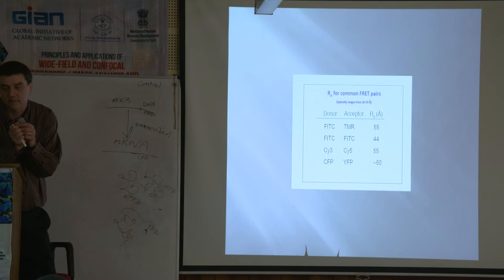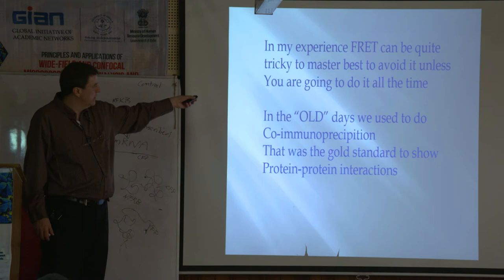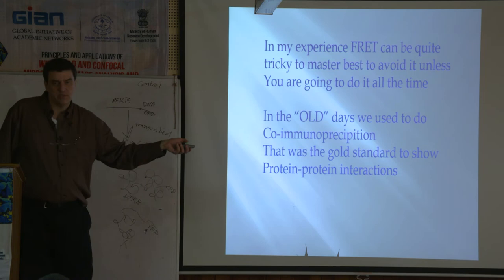What we used to do in the old days, so I think I get that out of the next one. Okay, so like I said, FRET can be hard. It can be tricky. Get another lab. But in the old days, what we used to do was something called co-immunoprecipitation.